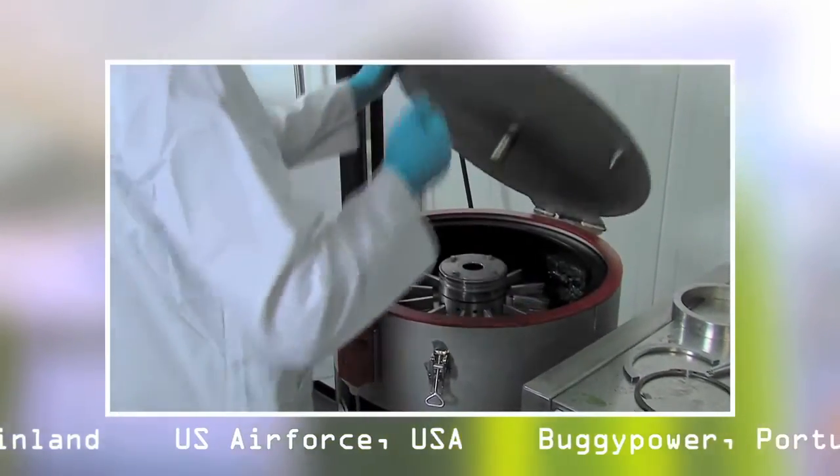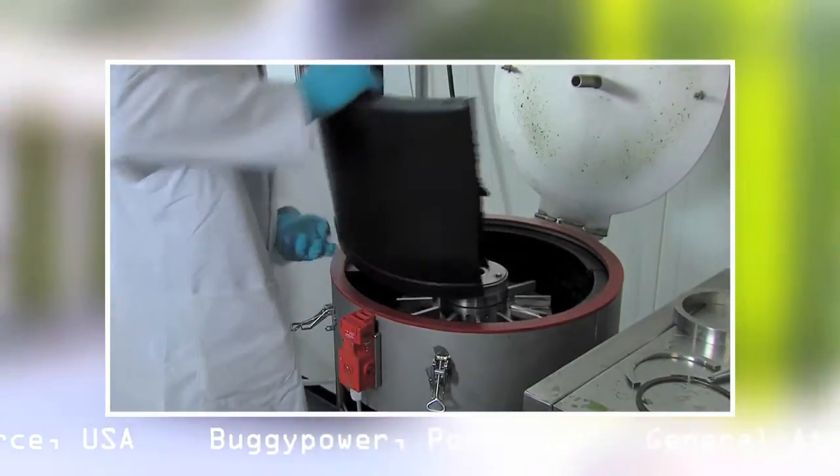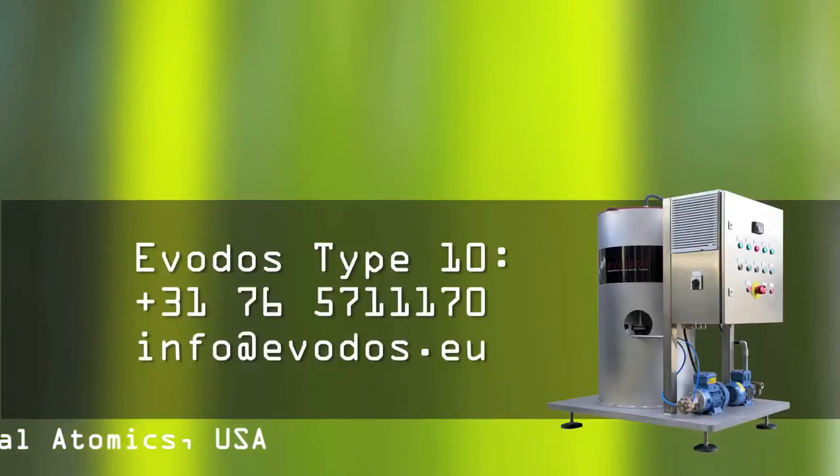Will you join the fast-growing Evodos algae harvesting customer base? Please apply for a proposal by giving them a call or just write an email. Evodos offers you the option to rent or purchase the Type 10 machine, or a combination thereof. Let us know what you prefer.